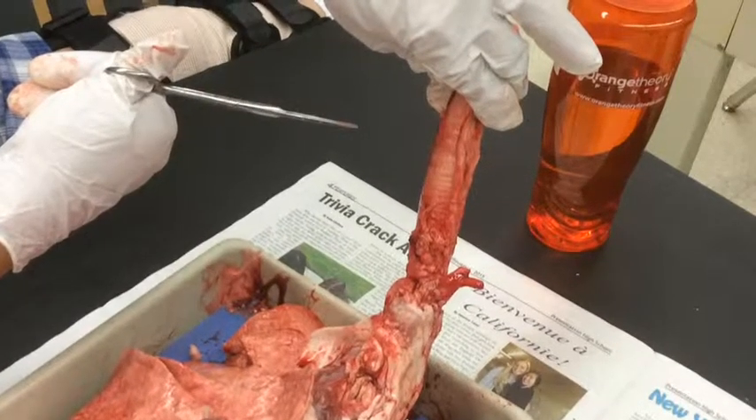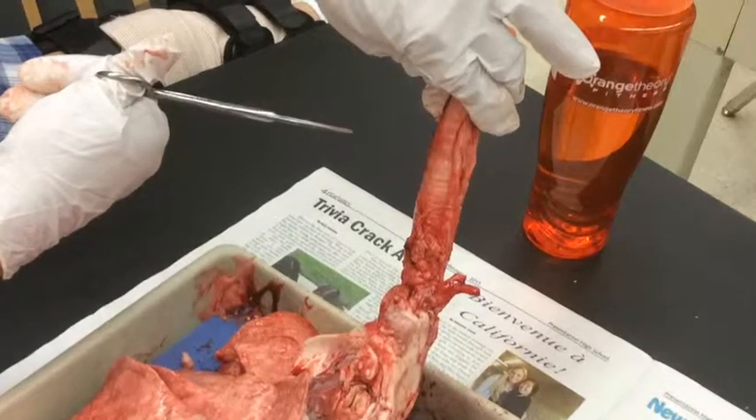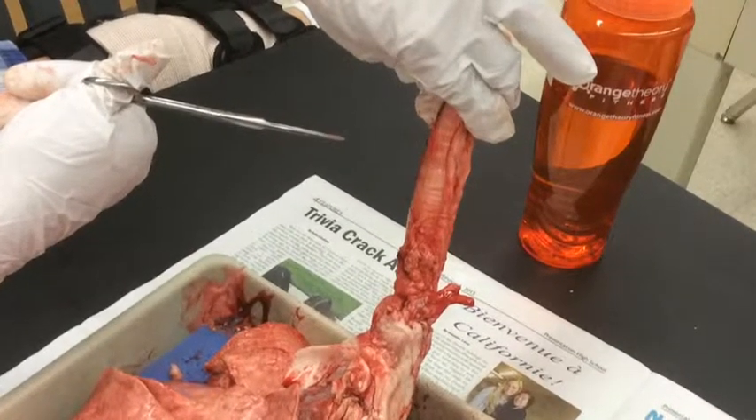Here is the trachea, and we have the rings that go around it. The rings are made up of cartilage. The trachea has rings to keep it open.